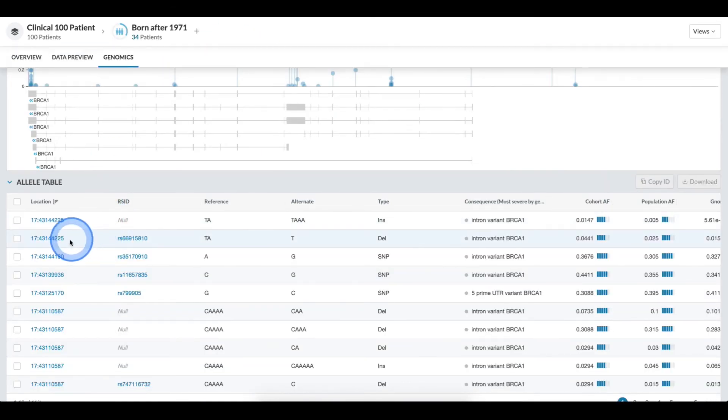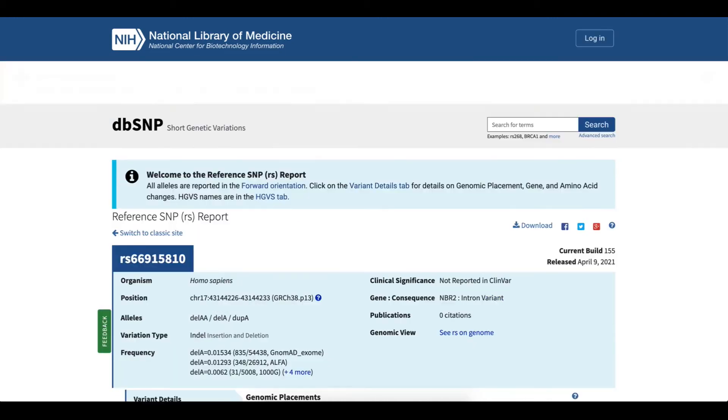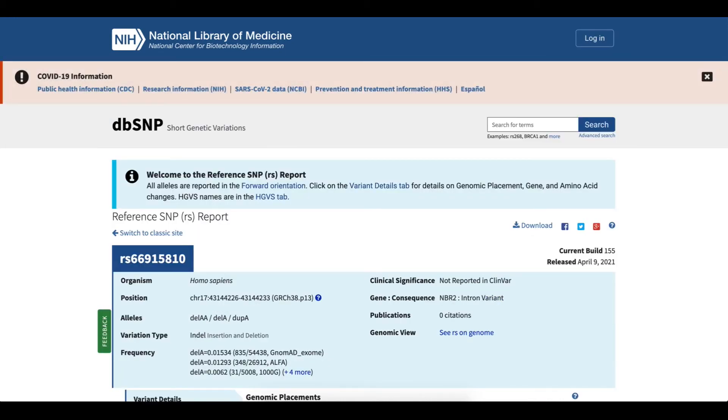Alternatively, for fields where an RSID exists, I can click the RSID location and bring up the NCBI page for this specific variant.